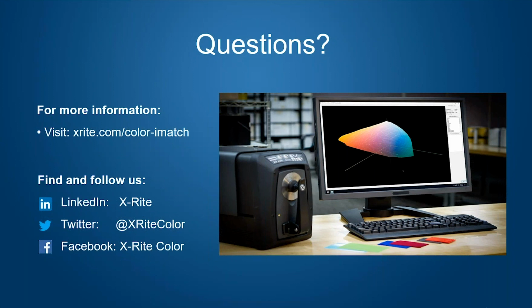How do you measure waste? Do you need to know what pigments are in the waste? First part of the question, how do we measure them? We just measure them, depending on what type of instrument you have. We do not need to know what is in them. The system will automatically generate what it thinks is the formula for that, and then use that for correction. So you don't have to tell the system what you think is in the waste.